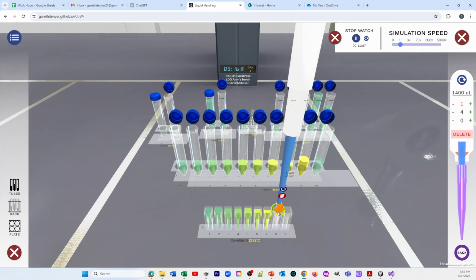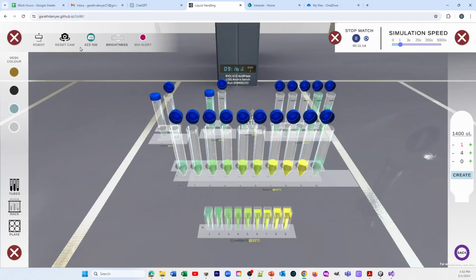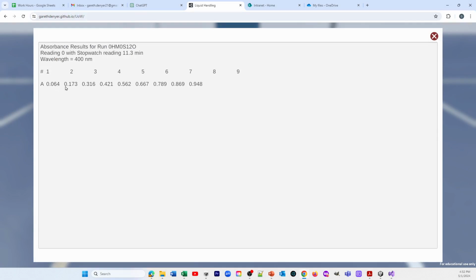But this is looking pretty nice. We've got a lovely gradation of yellowness. And if we go and set the wavelength properly to 400 nanometers and then click on absorbance, we can see this lovely gradation. So 0, 1 minute, 2 minute, 3 minute, 4 minute, 5, 6, 7, 8, and the absorbance is going up beautifully. That shows the pNP in a lovely time-dependent manner.